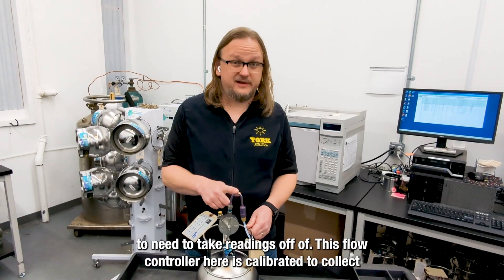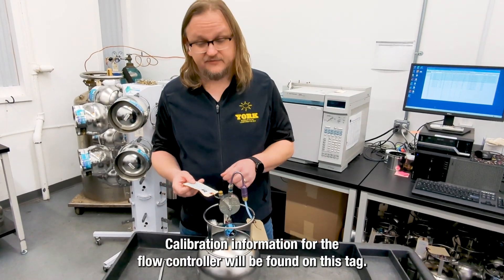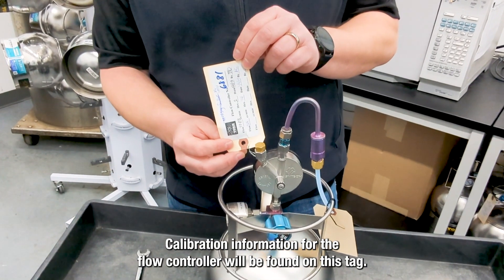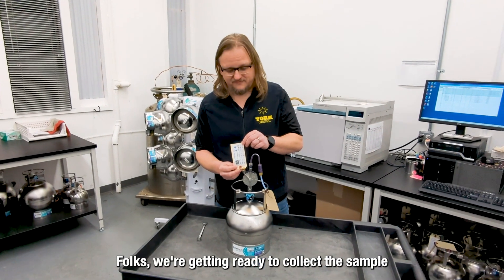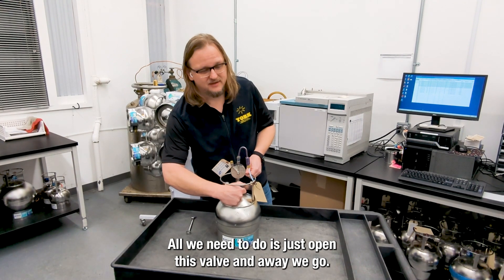This flow controller here is calibrated to collect a 15-minute sample. Calibration information for the flow controller will be found on this tag. We're getting ready to collect a sample — 15 minutes. All we need to do is just open this valve and away we go.